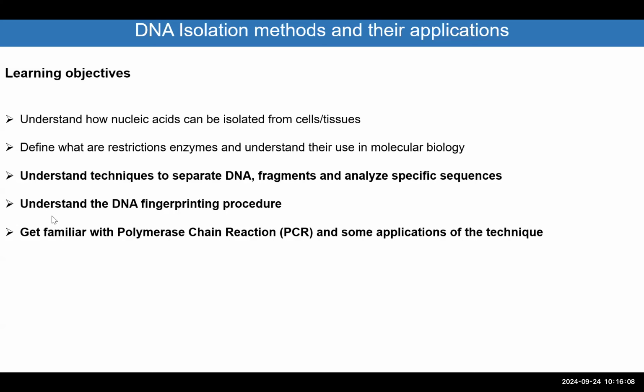and then we will discuss a bit about DNA fingerprinting, because this is one of the procedures that depends on isolating DNA, digesting DNA, running DNA on electrophoresis, and then how you can differentiate between two people, or one patient and one person who doesn't carry a mutation. And how can you say that this person is more predisposed to a disease versus another one? So all these applications are in principle what you have learned in the last 5-6 lectures.